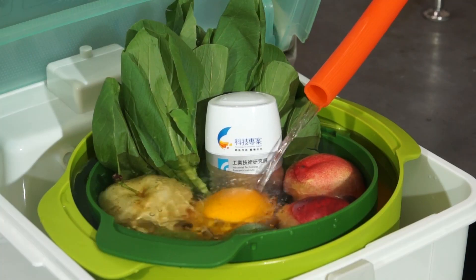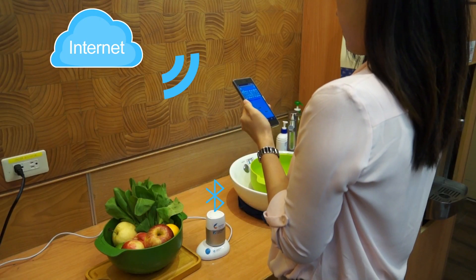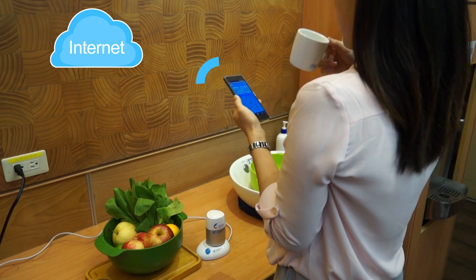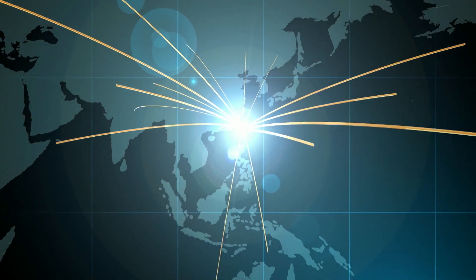The device can detect a residue amount as low as 0.5 ppm. In consideration of users' different habits, the device is equipped with Bluetooth for database updating to meet regional needs across the world.